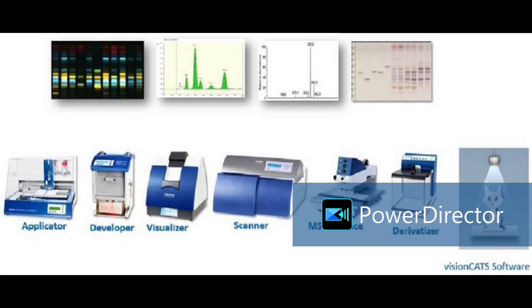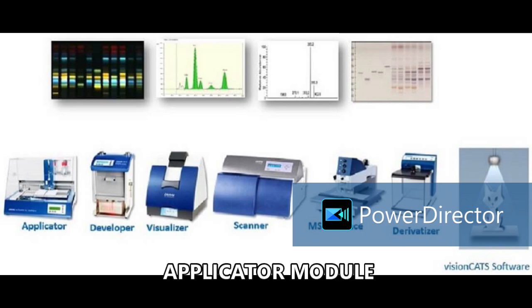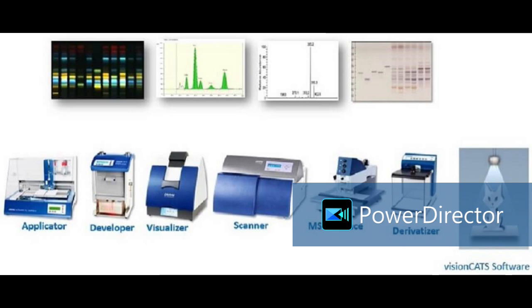So first of all, the applicator. The applicator will do application of liquid samples on the TLC or HPTLC plate. We are using the spray-on technique and band-wise sample application technique. So we are not spotting the sample on the TLC or HPTLC plate manually. It is through an automatic sample applicator. And for high sample throughput, as you said, ma'am, here we can keep 66 samples at a time in the vials. The syringe will go automatically into that particular sample and take the appropriate volume, which needs to be programmed initially. It is connected to one centralized software.